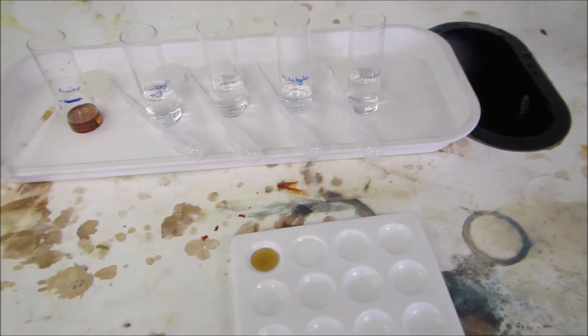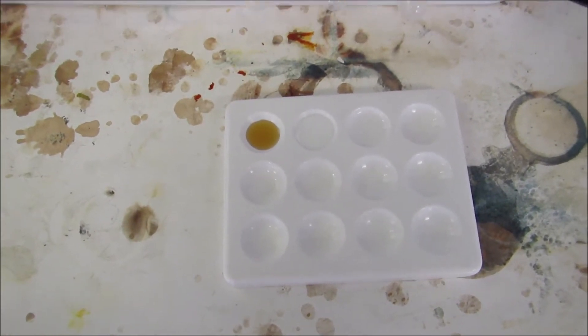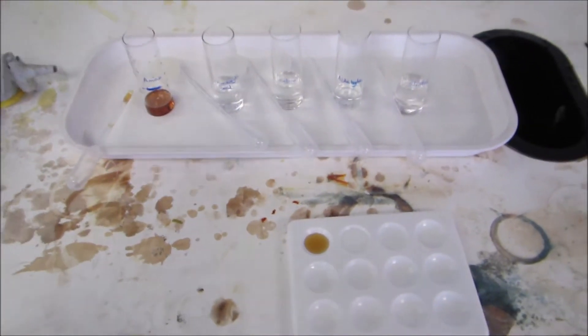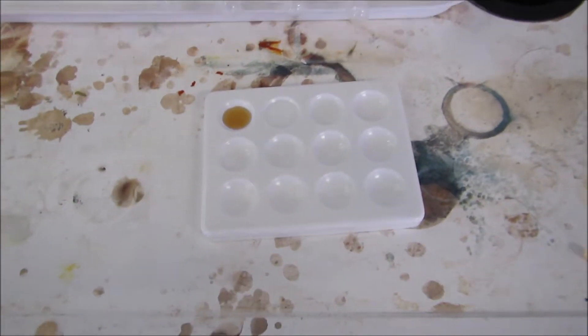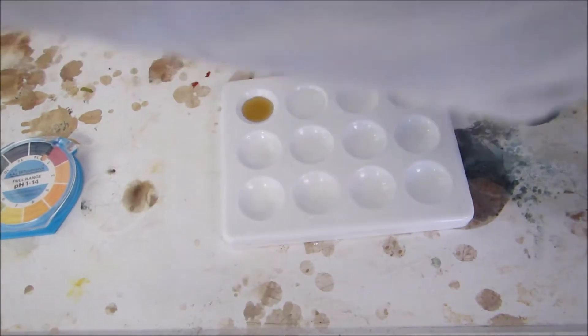Using some basic testing, the first thing I've done is I've taken a spotting tile and added five drops of each of the groups. I'm going to work out what the pH is because this can be used to identify.